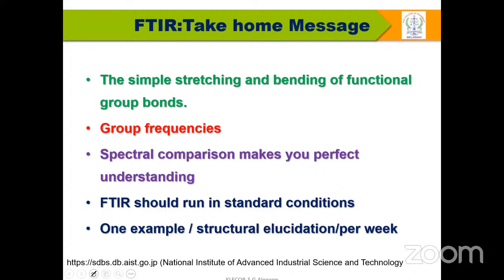Every day you can download n number of standard FTIR, IR, NMR, and mass spectra, and you can get the idea. But the best way to understand better is one example or one structural elucidation per week or per day, according to your convenience. So this is the one important take-home message from FTIR.